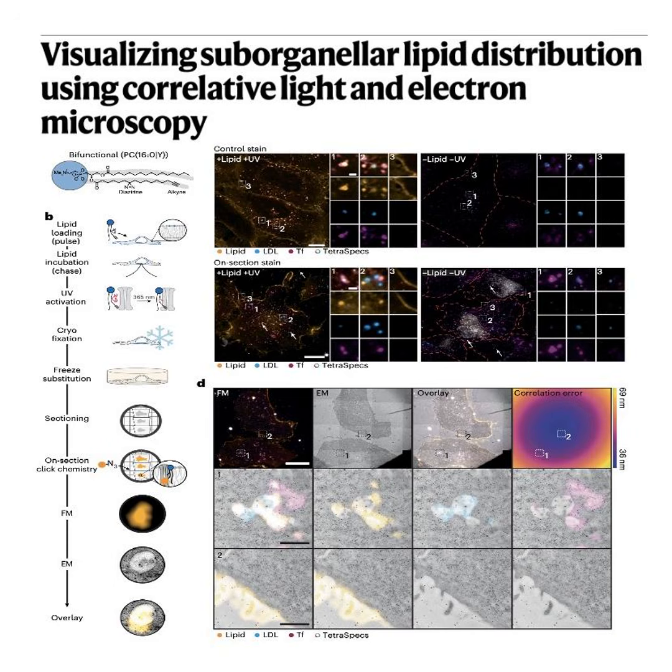Synthesizing all of this, the true value of this Nature Cell Biology report is the horizon it opens up. The so what, basically. Exactly. Lipid-CLEM isn't just a neat trick for one specific lipid. It provides the first generalizable, universally applicable workflow to study practically any lipid within the 3D ultrastructure of biological membranes. It's the missing analytical key we've been waiting for. It really is. We can now begin mapping complex architectures we have literally been blind to.